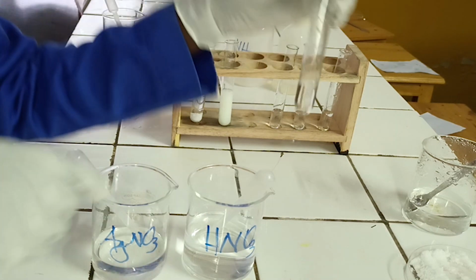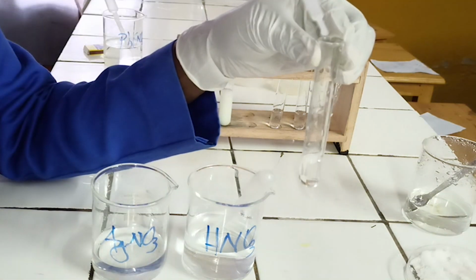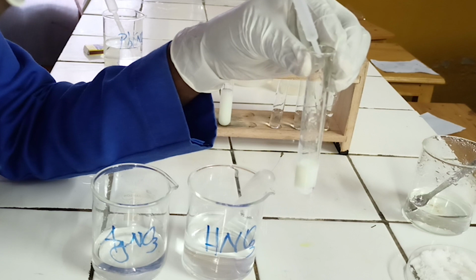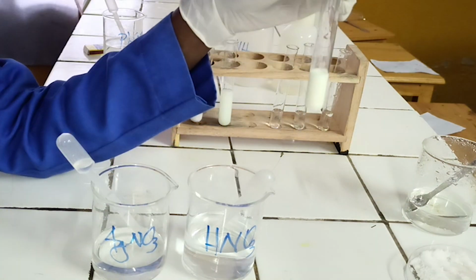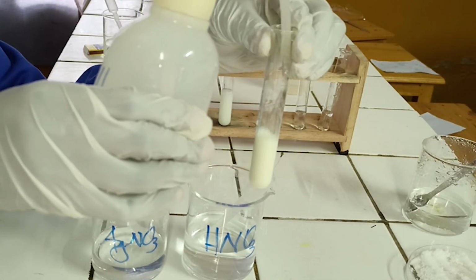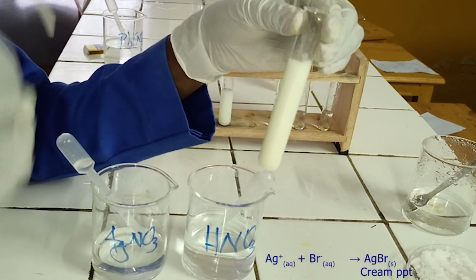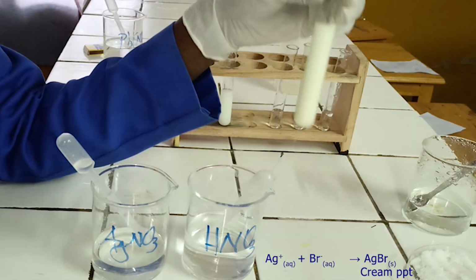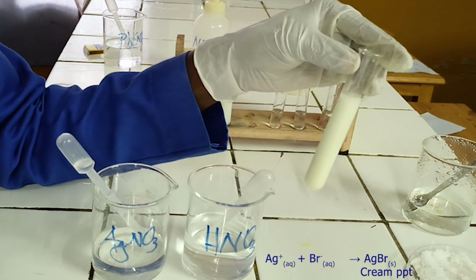To the third test tube, add silver nitrate solution followed by excess of diluted ammonia. As you see, silver nitrate solution reacts with bromide ion to form a cream precipitate. The precipitate formed is insoluble in excess of diluted ammonia. Below, there is the ionic equation for this reaction.